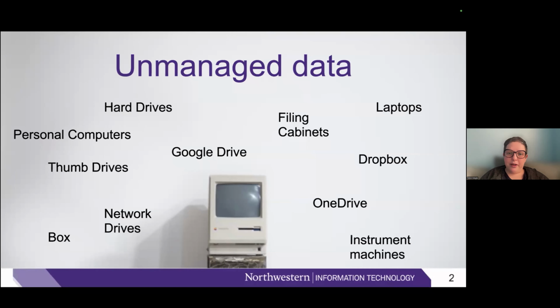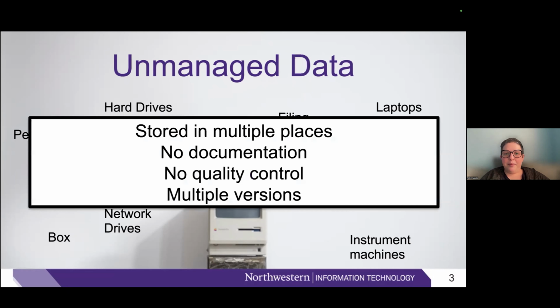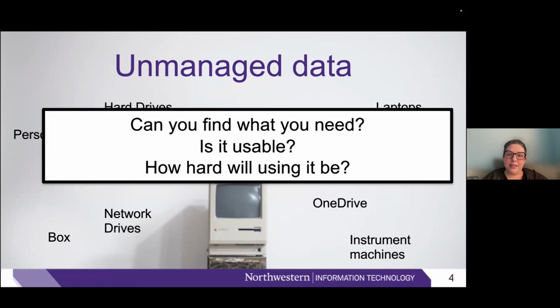So my data ended up everywhere. It was on my personal laptop, it was in Google Drive, it was on thumb drives. It was basically anywhere that you can think of to put data. And when I left that lab, I put all of my research data on a CD-ROM and it got put in a drawer somewhere. That probably dates me pretty well, but yeah, I think the default assumption in a lot of labs is that research data management isn't something that people should be spending a whole lot of time on. But if you don't think about it ahead of time, you get data that's stored everywhere, you don't have any documentation, there are no quality controls, and you don't know what the most recent version of anything is.